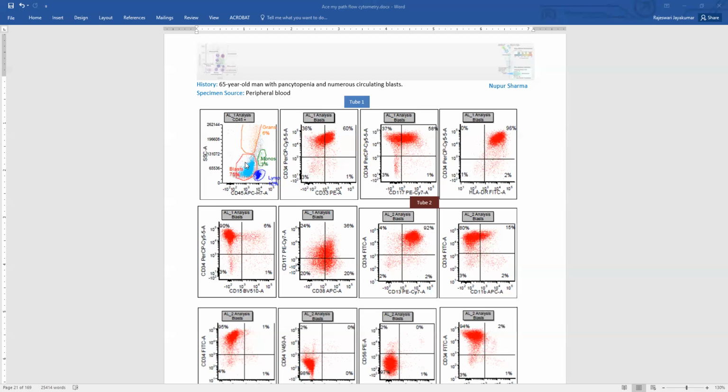And it also includes all types of blasts, like monoblasts and lymphoid blasts. So all the blasts sit here. Along with blasts, there are a couple more cells that are usually seen in the blast gate. Those are the basophils and plasmacytoid dendritic cells. CD123 and HLA-DR can be used to isolate those cells, and we'll see that in some chapters that we go over later.